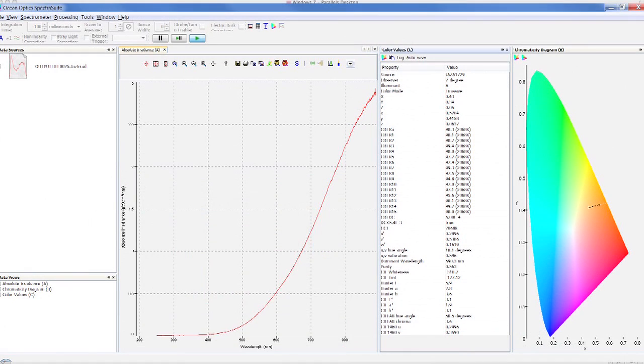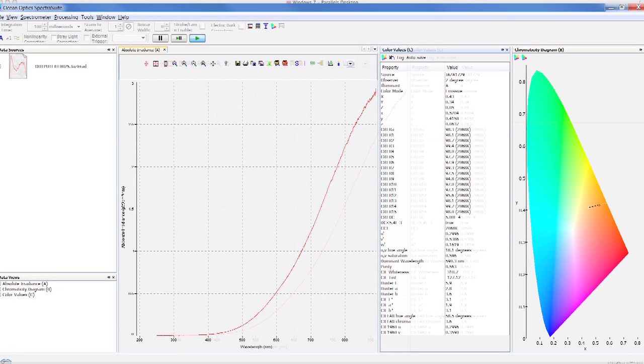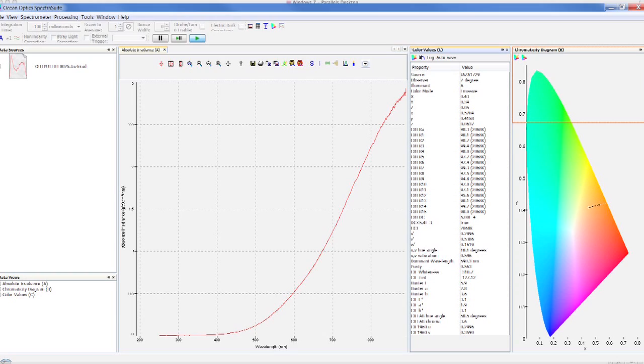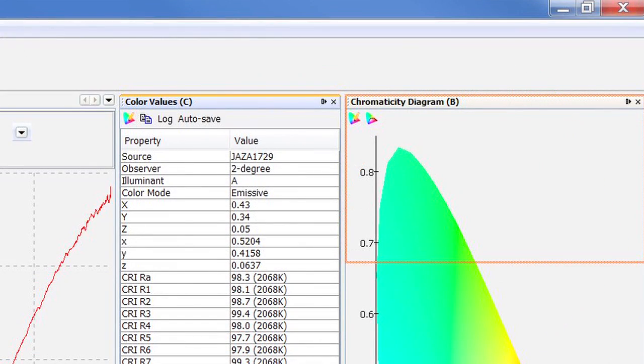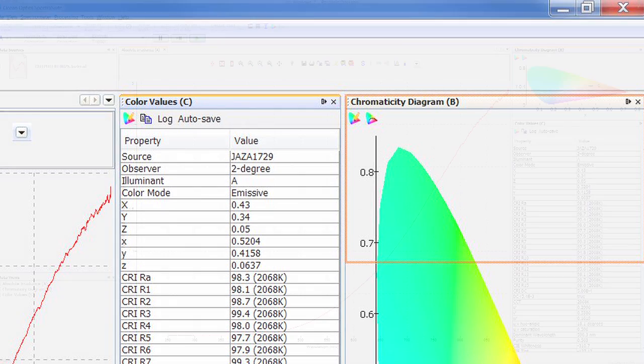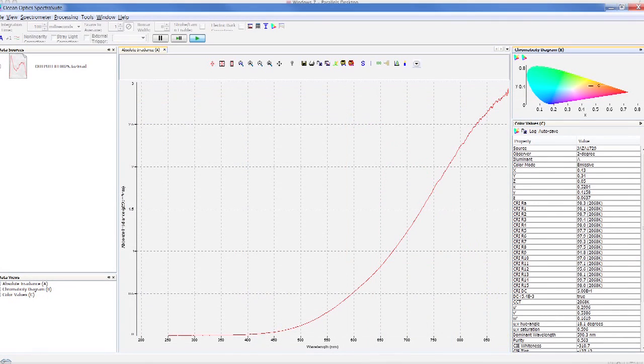We'll rotate this window to the right for a more suitable viewing environment. To do this, click on the top header bar of the box by using the left mouse button. While holding this button down, move the mouse to the right to select the position you desire. You will see orange boxes appear in different locations as you move the mouse. The window will then move to the last box indicated.